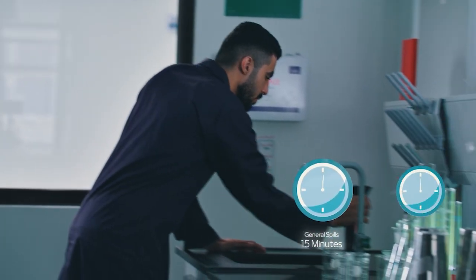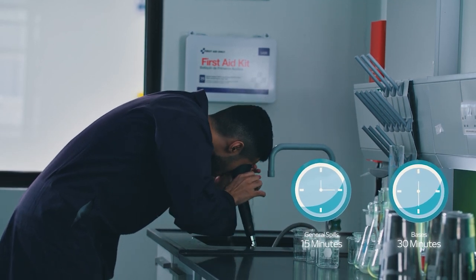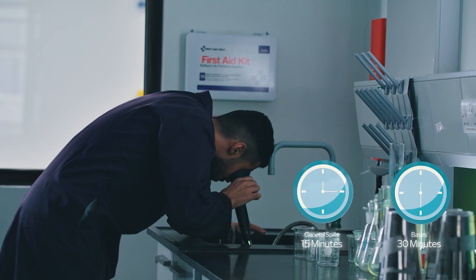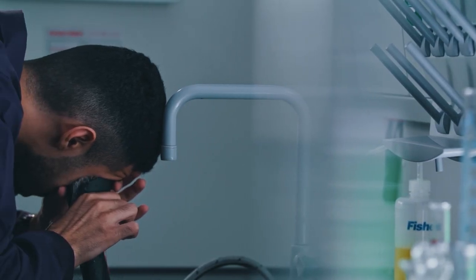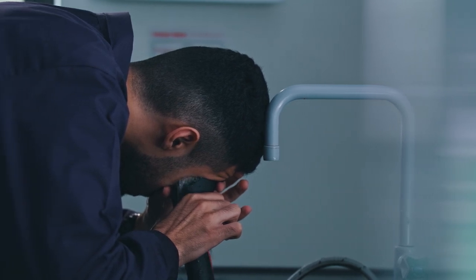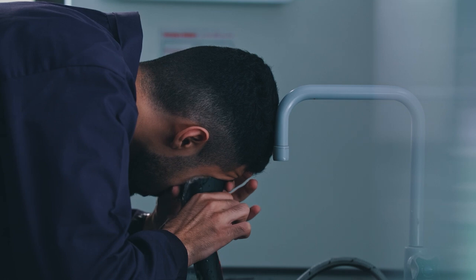If you are splashed in the eye with chemicals, go quickly to the nearest eye wash station and flush the eye for at least 15 minutes, 30 minutes for bases. You should use your thumb and forefinger to hold your eyelids away from the eyeball and move your eye continuously, up and down and sideways, to flush the area behind the eyelid.